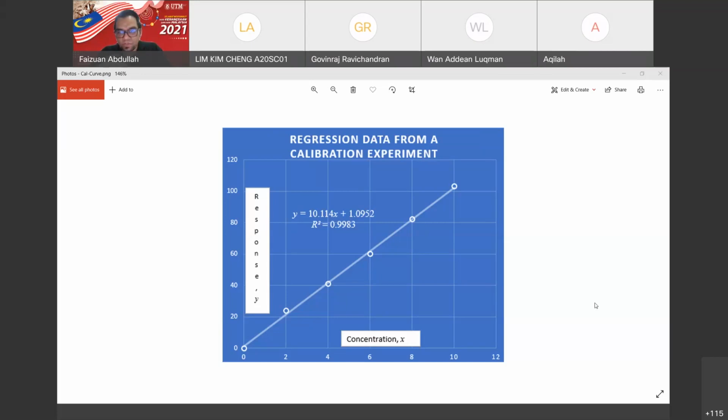We run only this solution with the AAS instrument, so that the AAS reads this as a blank, a solution without any zinc inside it. Now, we're analyzing zinc, so we put the hollow cathode lamp with the zinc energy source, and the wavelength is for zinc. And we run the blank from the distilled water, and then we tell the instrument.